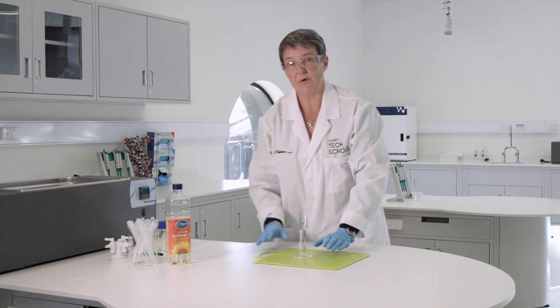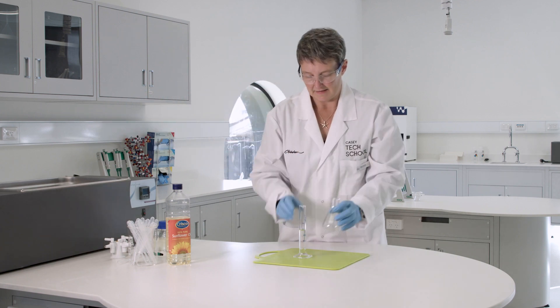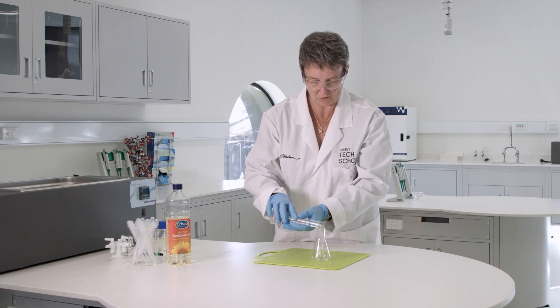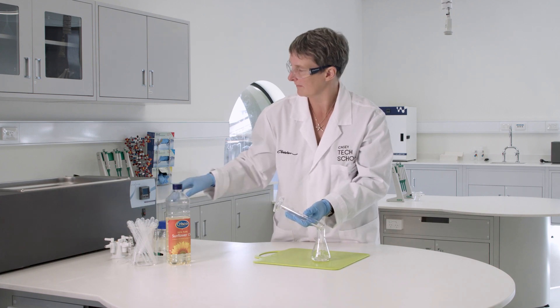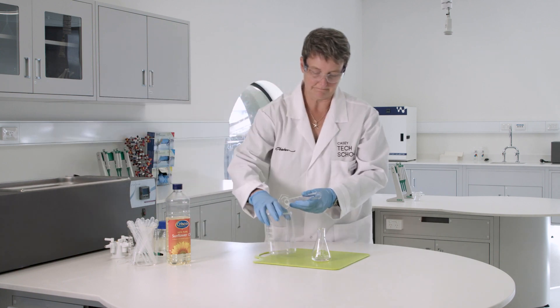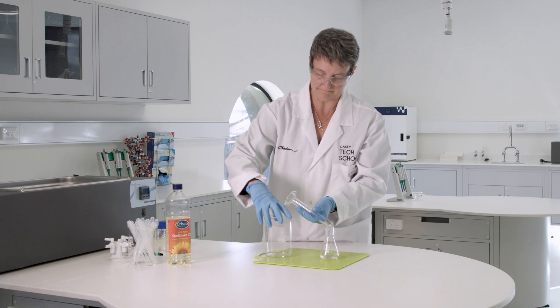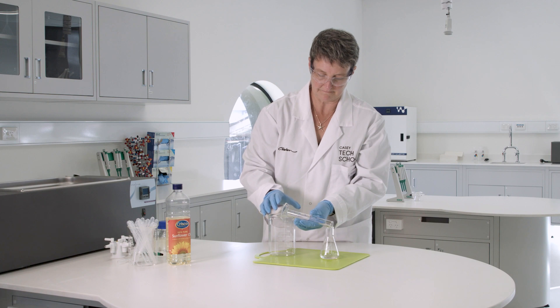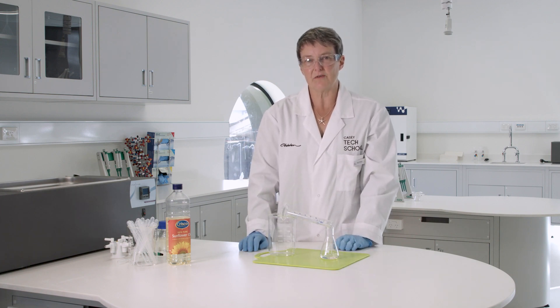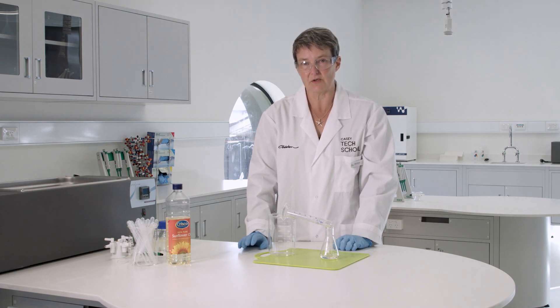Now I need to pour that sunflower oil into a conical flask. That's going to take time because of the viscosity of the oil, and we want to make sure we get all of it. So we pour it in and hold it in place for a moment. You might want to wait a couple of minutes and do some of your chemical calculations to make sure you've poured all of your oil into your conical flask.